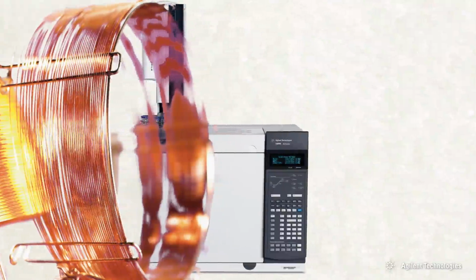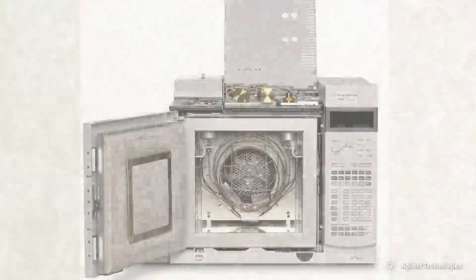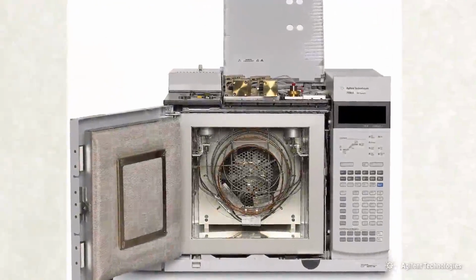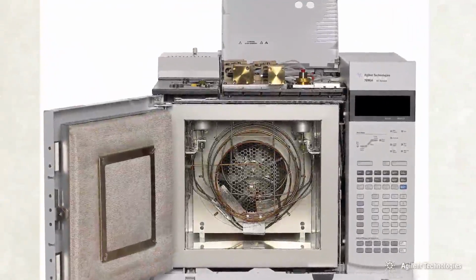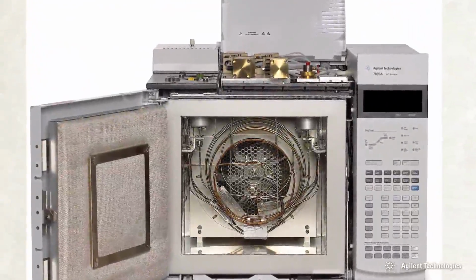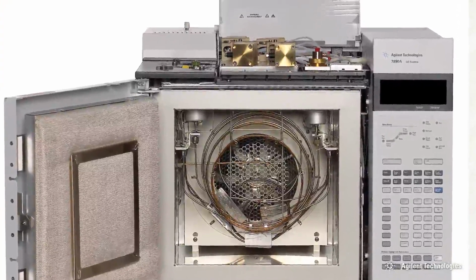Most applications today use capillary-type columns. However, there are some specific applications, for example, fixed gas analysis, where packed columns are still used. We'll cover more about packed columns later.